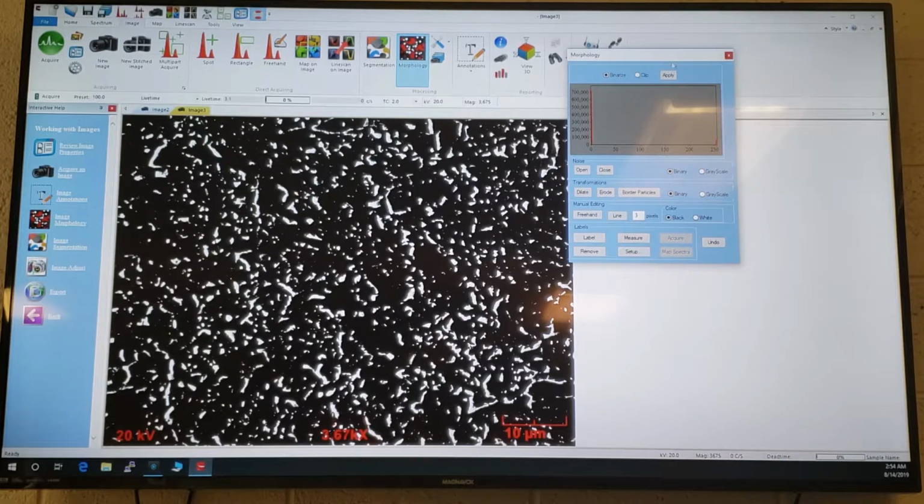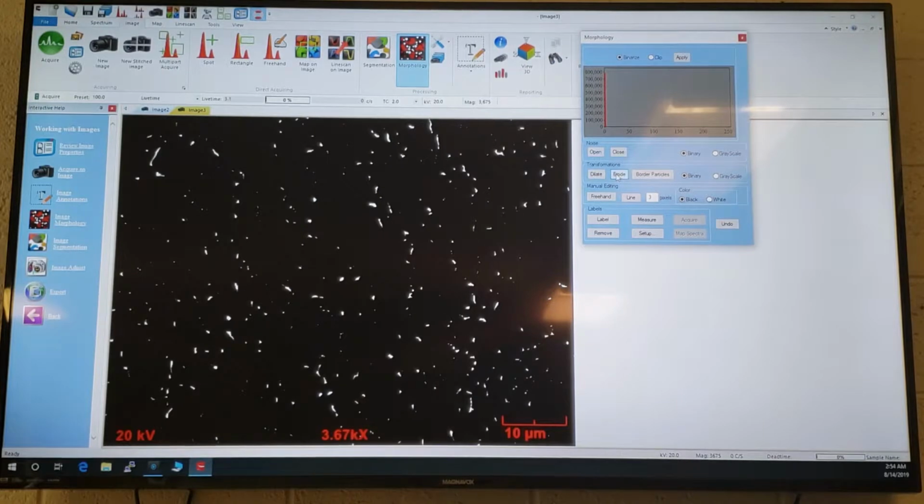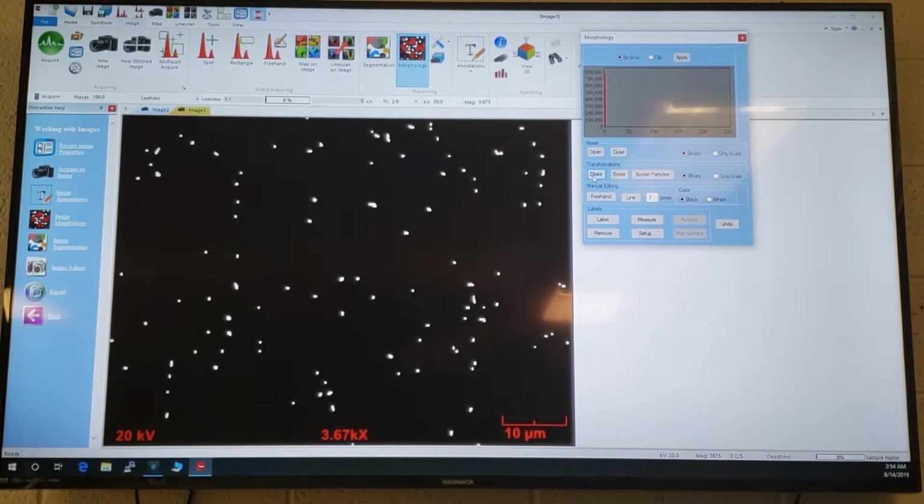And so this is a very base particle analysis software package. So right now, if it's saying these are particles, not great, they're not all particles, but in here I could erode, for instance, which gets rid of any border stuff. So if I erode 3 times, I'll dilate 3 times and bring it back, 1, 2, 3, let's say.